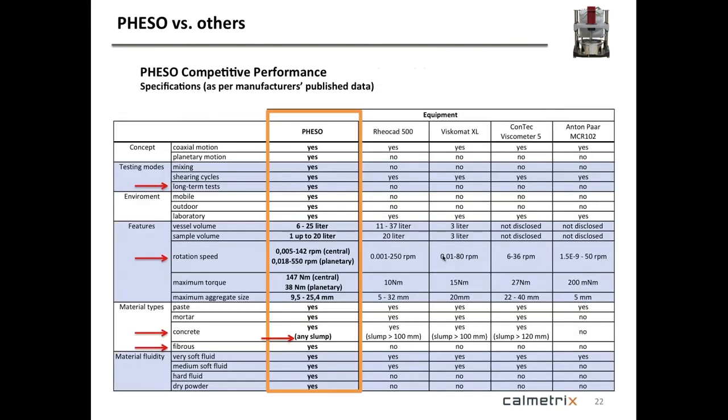And because I've been talking about some other rheometers that are in the market, we actually have a small comparative table. And here, I want to say somewhat arbitrarily, I picked a few. One of them is a pure paste rheometer, the one from Anton Paar. And I would say it's representative of what other paste rheometers are. Pretty similar in terms of performance and what it can do and what it can't. And then the other three are some commonly seen rheometers that are sold as concrete rheometers.